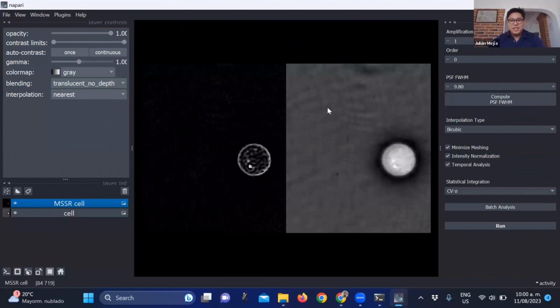Please also notice that I'm cheating a little bit here, because this is bright field. In principle, these methods are only for fluorescence fluctuation, that means dark field background. But check this out. You manage to retrieve really nice structures.